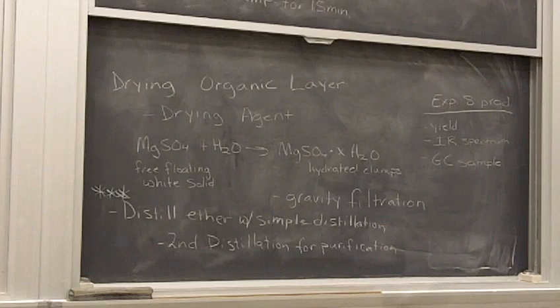We use it throughout the experiment, so be really careful with the ether. Part of why we have to be really careful when we add solutions in ether is to not get them too hot. We don't want anything starting on fire. But also be careful of it when you are going to heat things because of the flammability of the ether. All right?